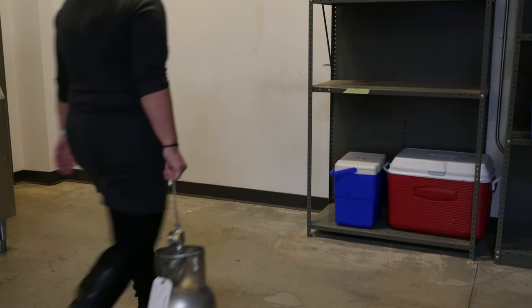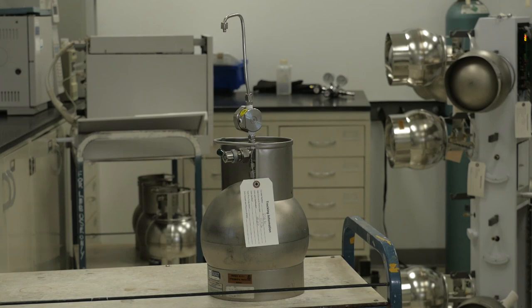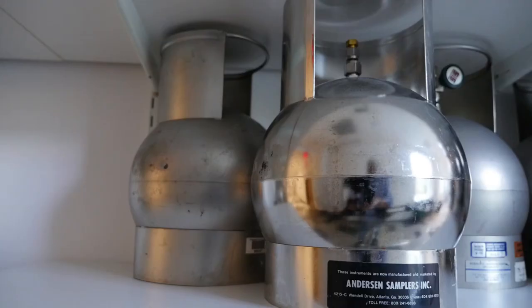To this date, at Walton and Lonsbury, I have done indoor air sampling at residential properties and we were looking for TCE and PCE, the primary contaminants of concern there. Each home, we set up a basement sample, we set up a first floor canister sample.